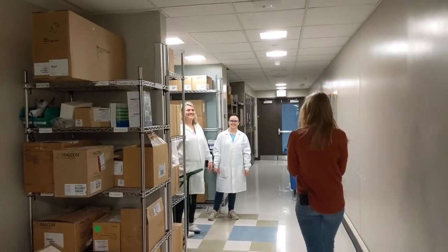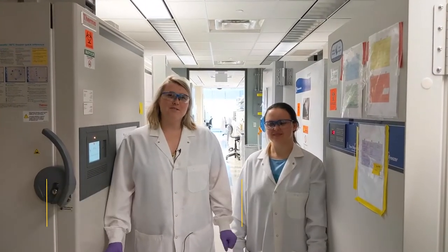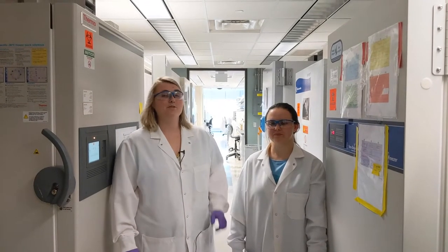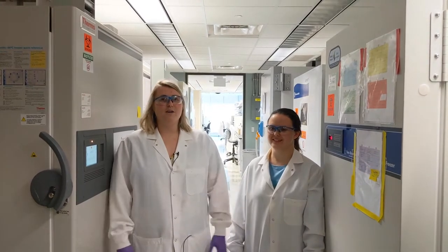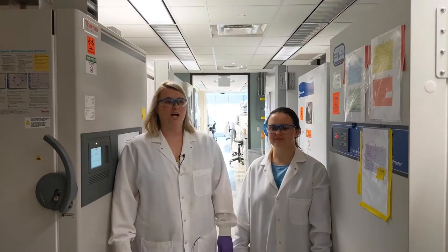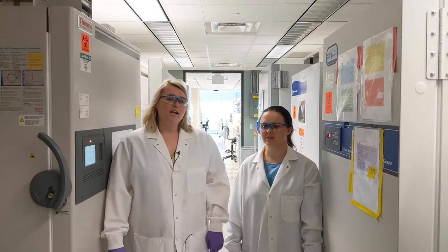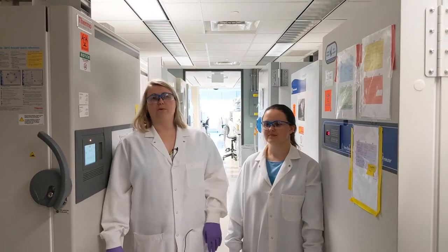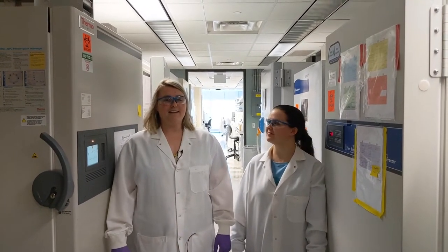Hello, nice to see you all. Hi, I'm Emma, this is Kaylee, and we are both fourth year graduate students in the Nagrath lab, Sunitha Nagrath lab. Our lab primarily works with cancer cells, so we design microfluidic devices to isolate cancer cells from patient blood, and we mostly use these for studies to look at whether a patient's treatment is working, whether we could predict if their treatment is working, and things like that.